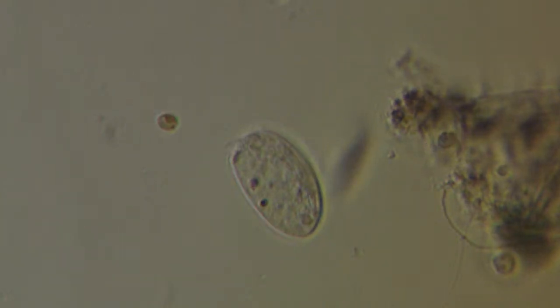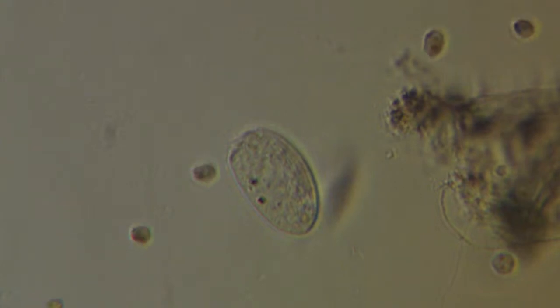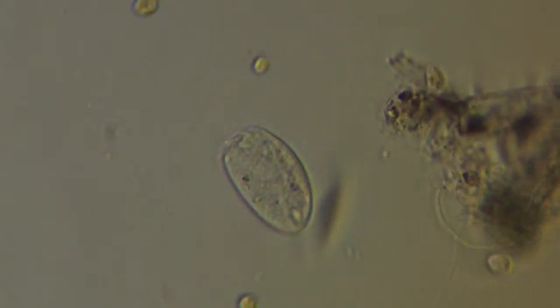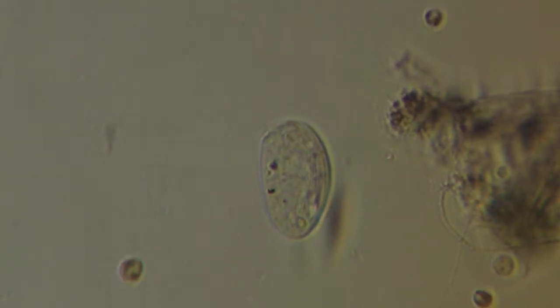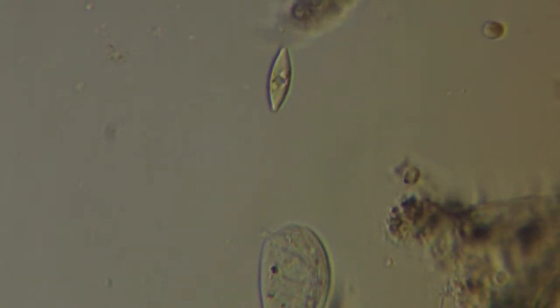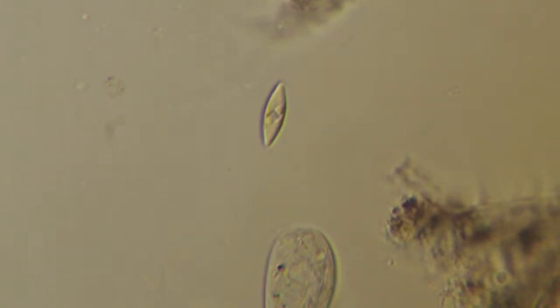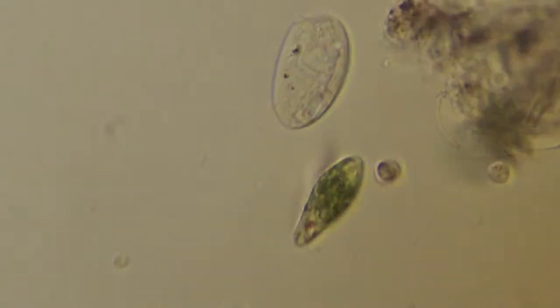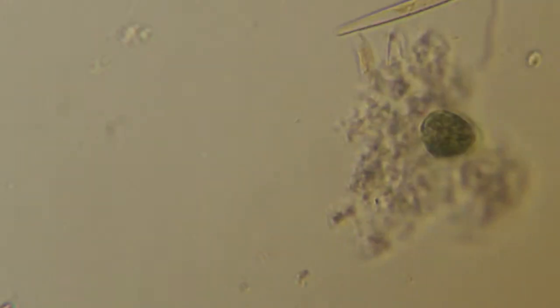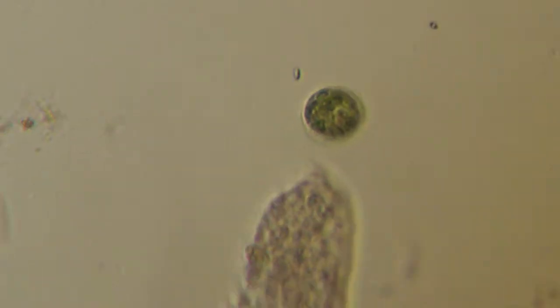This one has some interesting striations going down the long end of the cell. A little diatom above it here. And more Euglena. This one's all balled up. Probably not doing so well. What else we got? The slide is drying out.